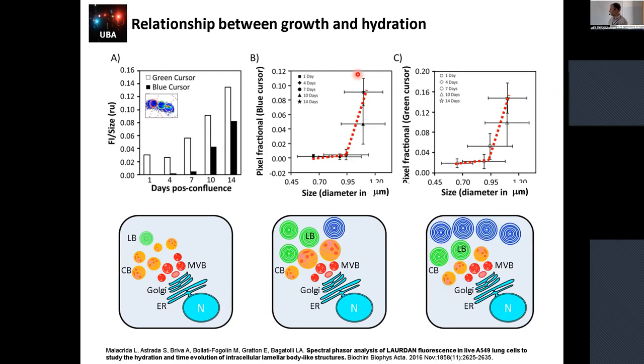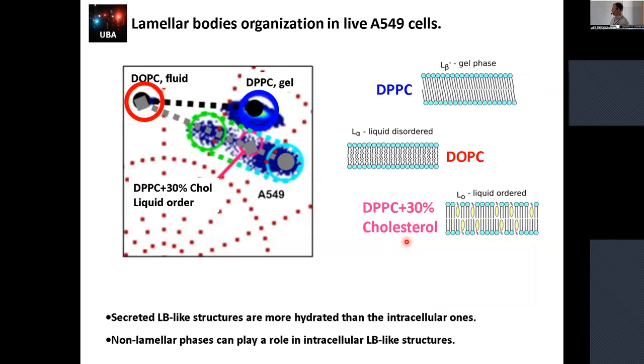an explanation of that. At the beginning, we basically have a preliminary version of the lamellar bodies. They are called multivesicular vesicles or composite bodies, and they are growing in size. After some point, they begin to fill with lipids and protein. After we reach that point, they get mature and are organized in highly packed organelles. What we discovered also is that this time information was very important, and in the next slide, I will explain why time information is important.